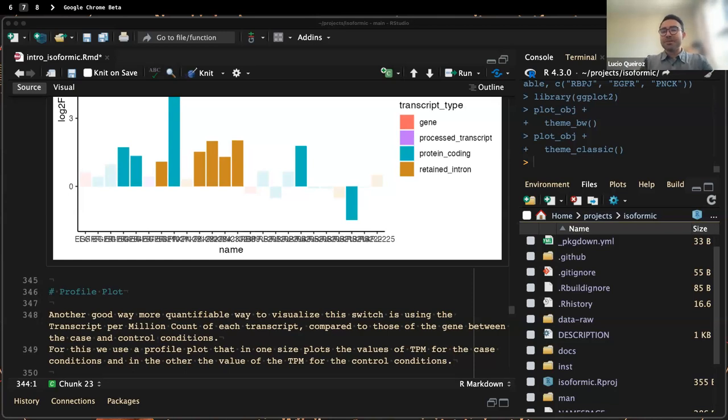The more established or pure your samples are, the better the consistency you will probably find in which transcripts are expressed, compared to, for example, experiments with cell lines. With animal models that have the same genetic background, you would expect the same isoforms to be expressed in the same tissue. But if you are dealing with patient data, most of the time there is going to be some variance that comes from genetic diversity. That is where the number of samples or the depth of sequencing needs to be improved, because human data is pretty hard, as the patients are not genetically homogeneous. For this data set specifically, it was very hard to find one that had the patients well paired to do this.